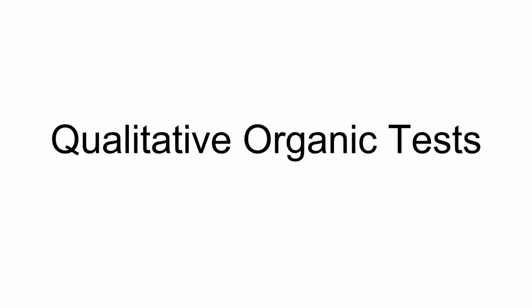Hello and welcome. Today I'll be going over the qualitative organic tests for different functional groups that you've learnt about in your organic chemistry modules.